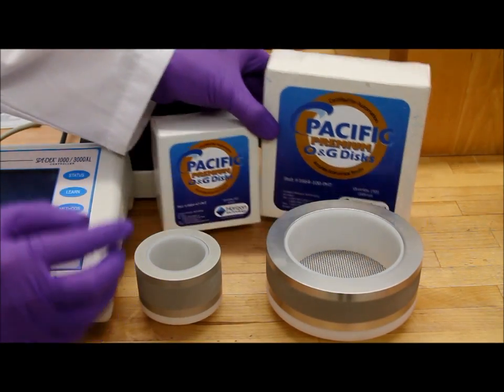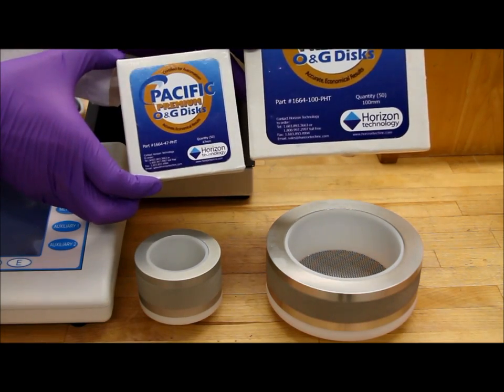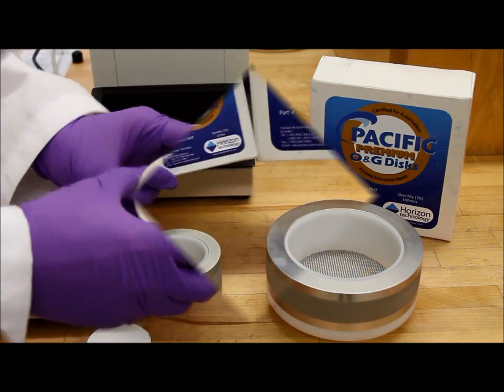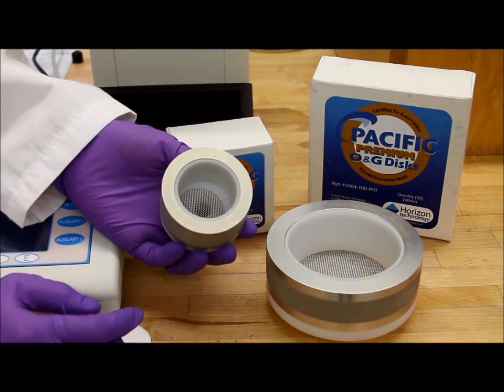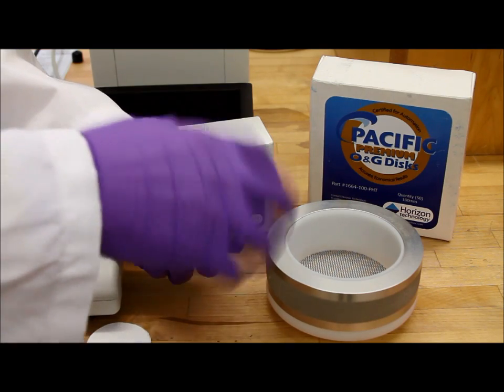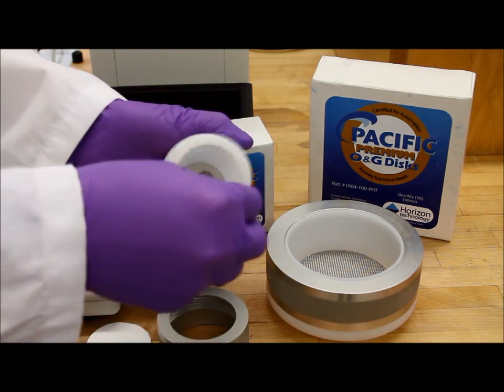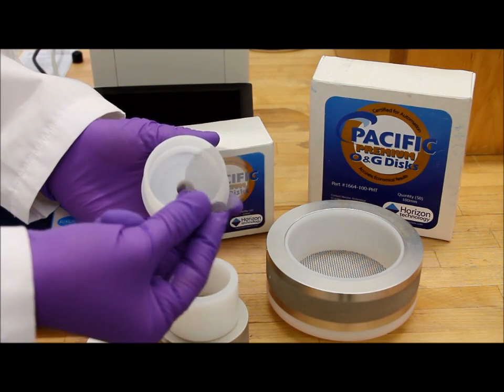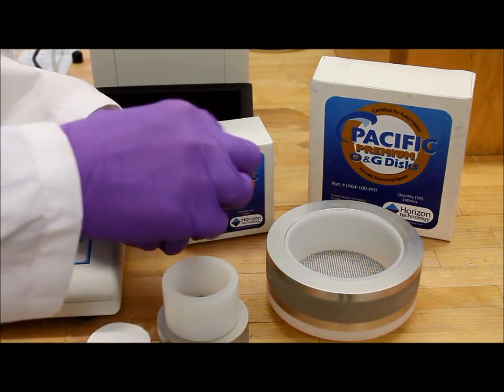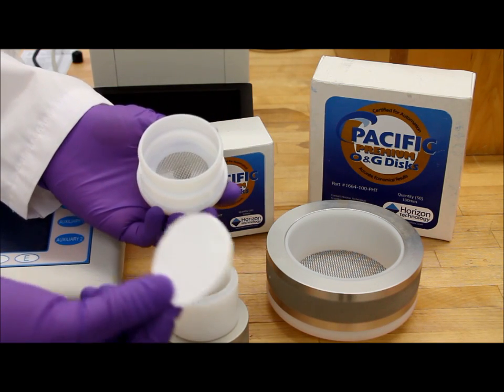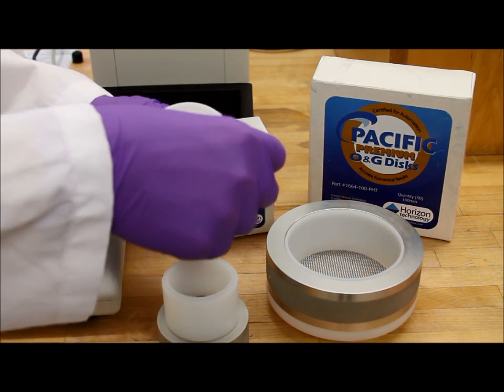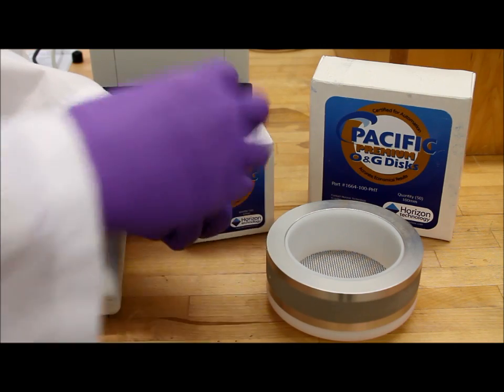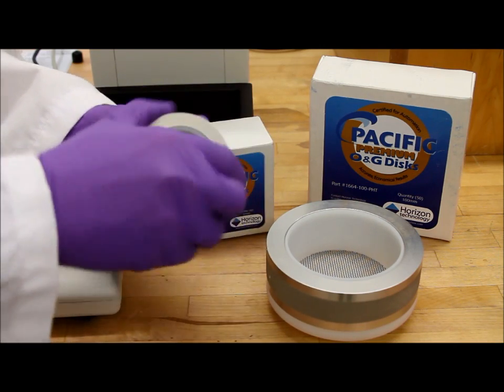We have two different types of discs. One is a 47mm and one is a 90mm. To assemble your SPE disc into your disc holder, just unscrew it as such and here is your SPE disc supporter which is a fine mesh screen. Put the disc in and simply screw it back on.